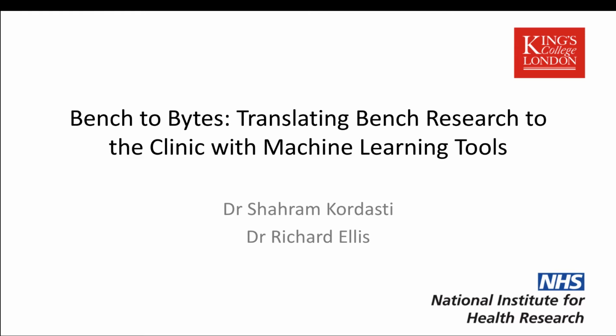Today, we're going to talk about what we did about regulatory T cells study by CyTOF with Richard, who's here. Hi. And I'm going to talk about the experiment we designed to identify subpopulations of Tregs and how these Tregs correlate with response to immunosuppressive therapy.